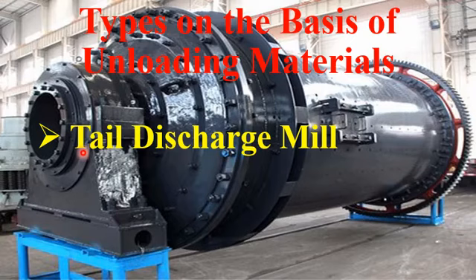Okay, the precursor material or the bulk material which we want to convert into a very fine nanoparticle is incorporated either from head or tail, depending on whether they act as an inlet or outlet. So when they are incorporated, then when they are crushed, they exit either from head or tail. So both the head and tail in the tail discharge ball mill apparatus act as inlet and outlet of the bulk material.